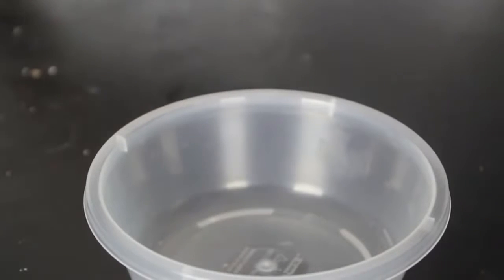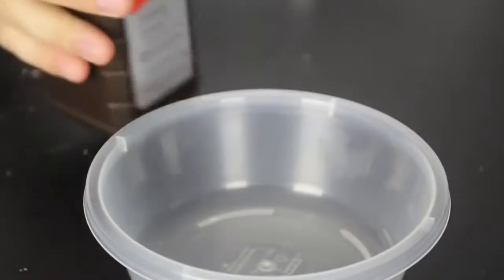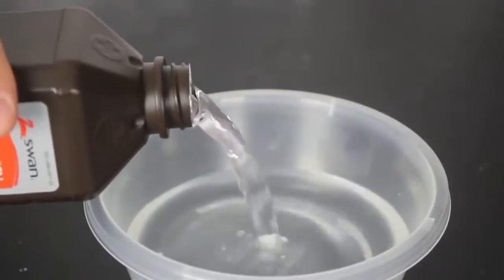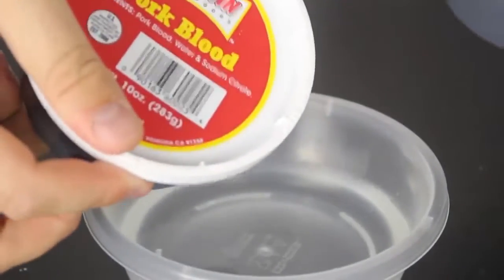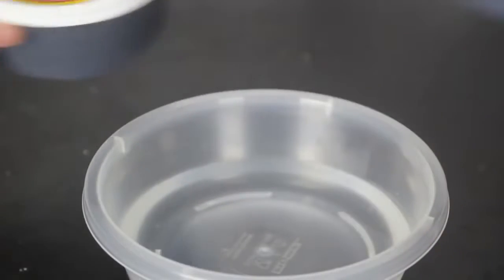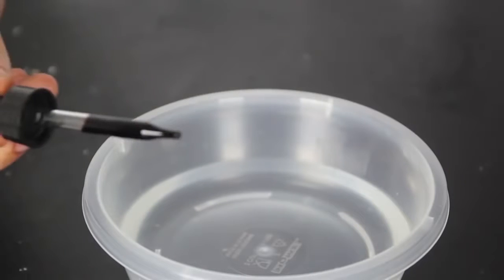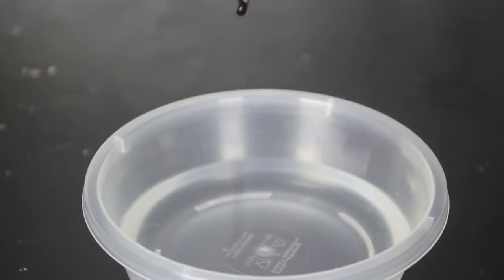Do not try this at home. I'm gonna grab 3% hydrogen peroxide, put it in a container just like that. And then I have pork blood and beef blood. I'm gonna drop a few drops in there and let's see what happens. I got blood in this tube, let's do it.